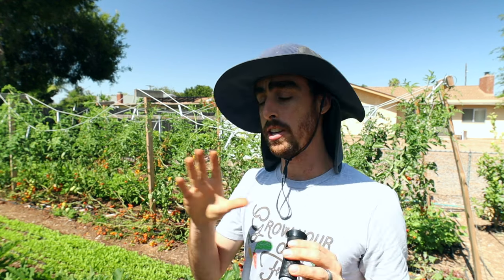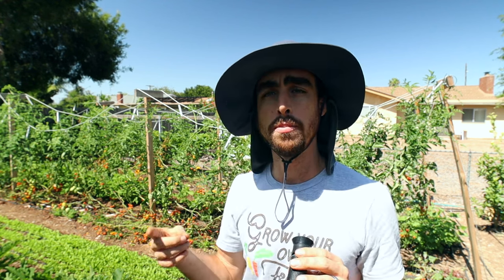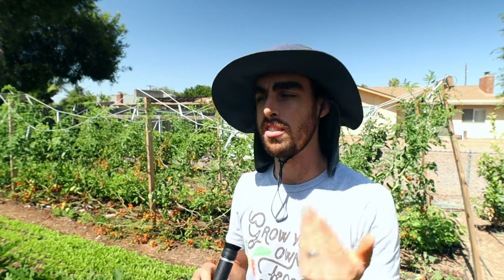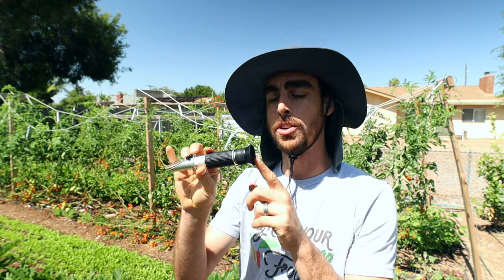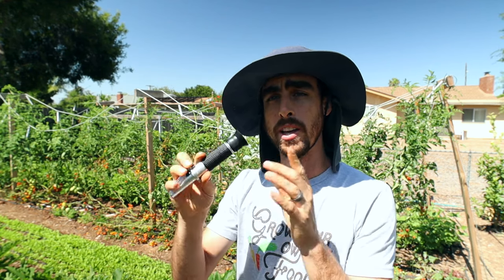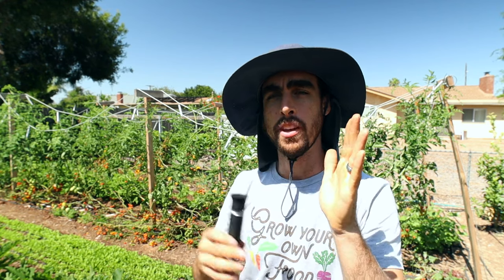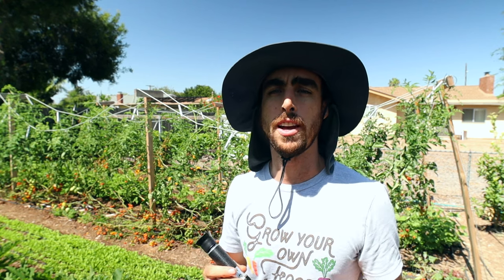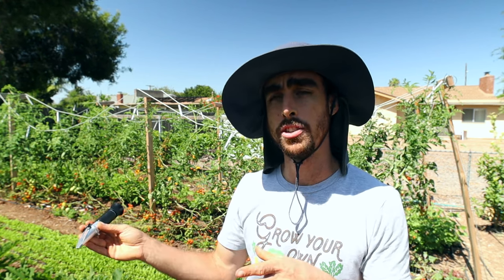So what we're going to do is test all my different fruit. I've got grapes, berries, tomatoes, cucumbers, we'll try some lettuce, some basil, whatever else I can find around here. I'll put the camera through here so you guys can see the reading as well, and I've got a printout chart of all the different levels so we can see how my fruit is doing and if it's at a high nutrient level or not.